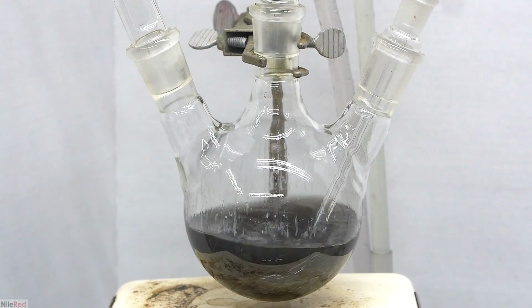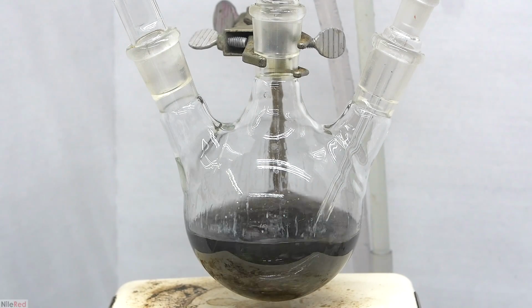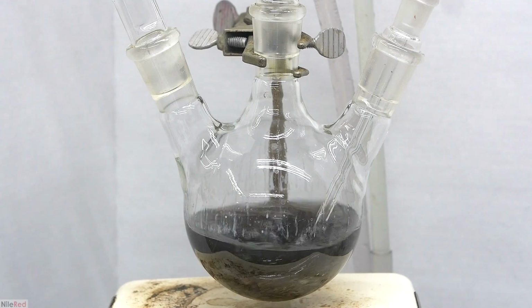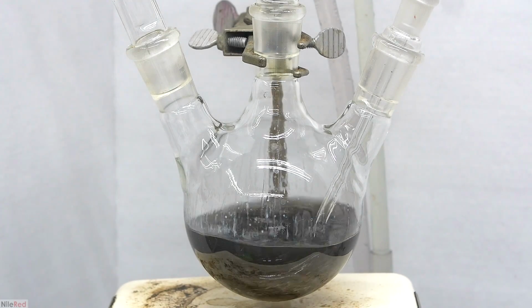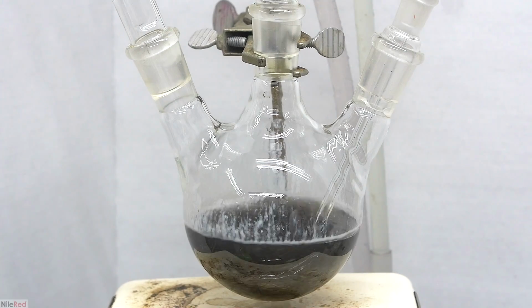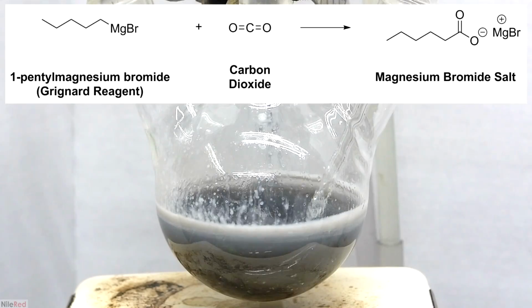As we add more carbon dioxide, the reaction will heat up, and we'll be condensing back a lot of diethyl ether. This is another reason to go slowly because we don't want to overload our condenser. We'll also start to get a white salt buildup on the side of the flask. As more CO2 is added, the salt content will build up, and the reaction mixture will almost take on a white color. So anyway, here's the reaction that's occurring.